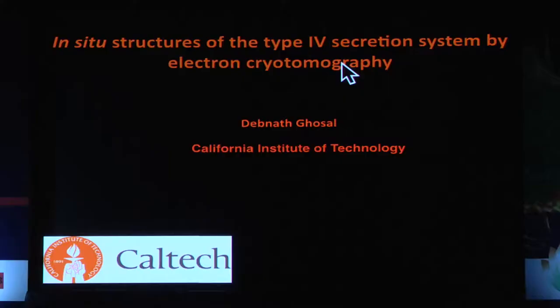They transfer small molecules, they transfer toxins, and they're responsible for many different disease conditions. But they're so big that it has been very difficult so far to study them by purifying them outside the cell. So we want to use electron cryotomography to study these molecular machines.